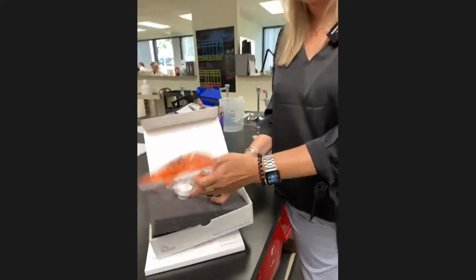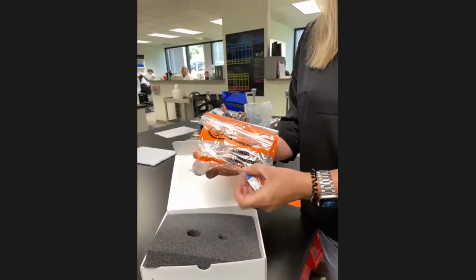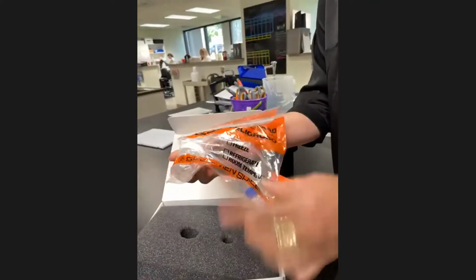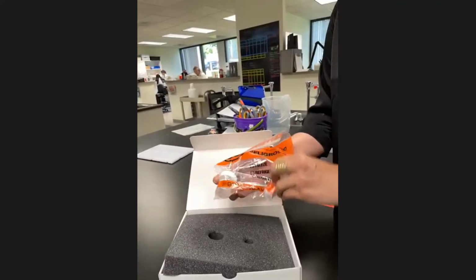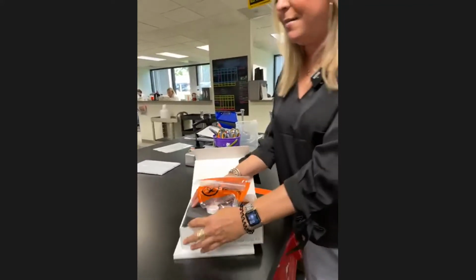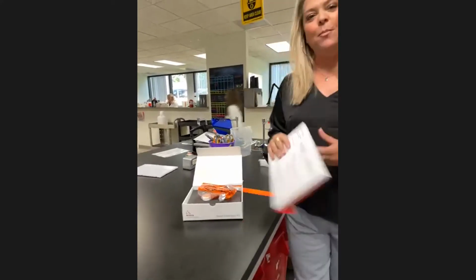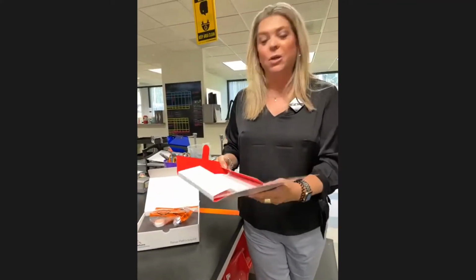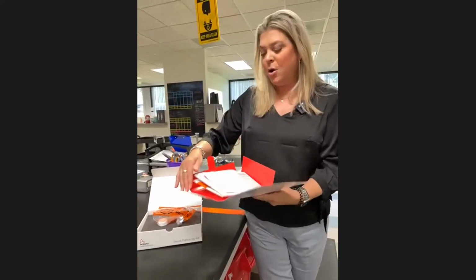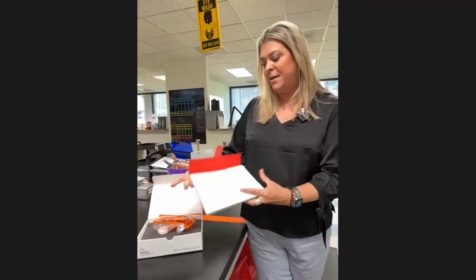First of all, like he mentioned, they take that tissue out of the bag and then they put a piece in each bottle. So we have 2 bottles with 2 different liquids here, something called formalin and something called Michel's. We put a piece of tissue in each of these bottles, and then we nest those down here in this foam inside of biohazard bags so nothing spills out. And then we also give them paperwork and instructions. Inside there is a piece of paper for clinical history, so we can get a better idea of what's going on with the patient, and obviously a FedEx pack that they can package all of this up in and drop in a FedEx box.